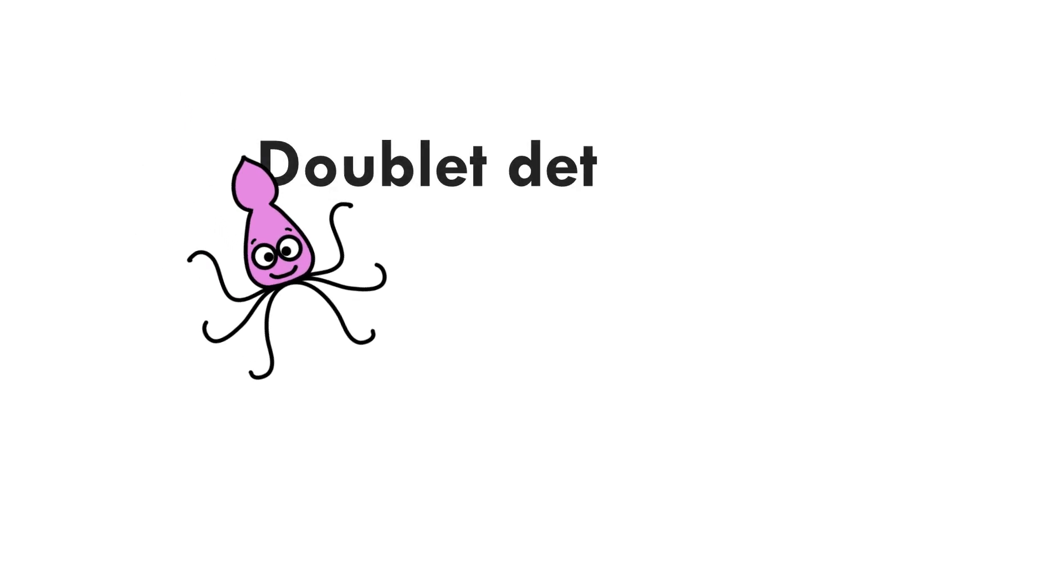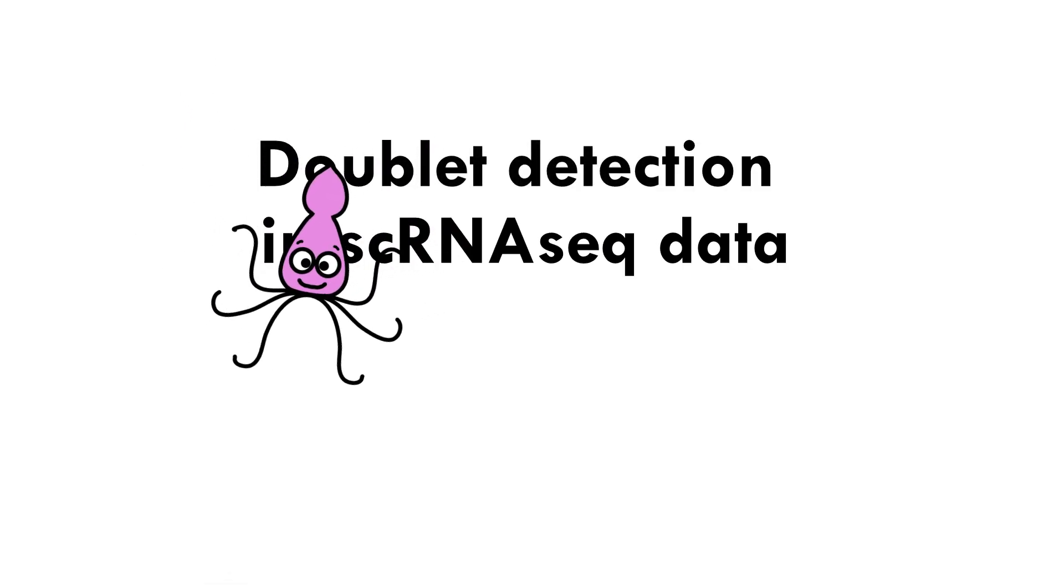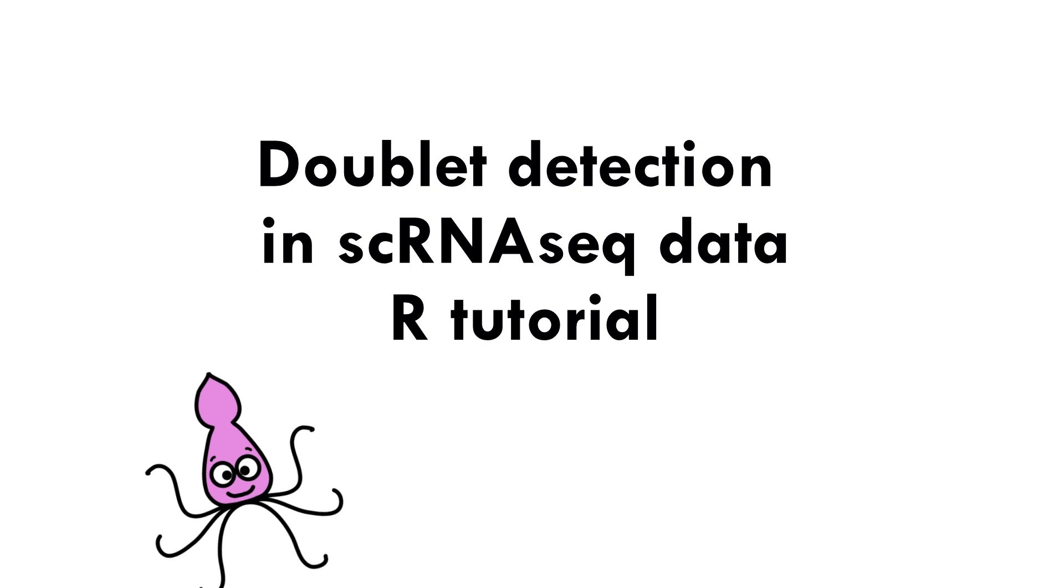Hi and welcome to BiostatSquid. In this tutorial we will learn how to detect and remove doublets from Seurat objects in R using doublet detection tools for single cell RNA-seq data.